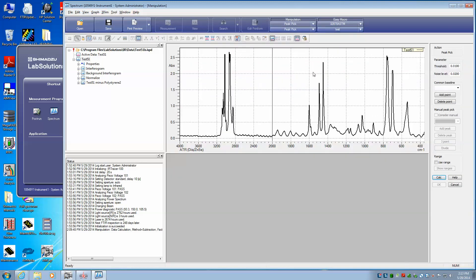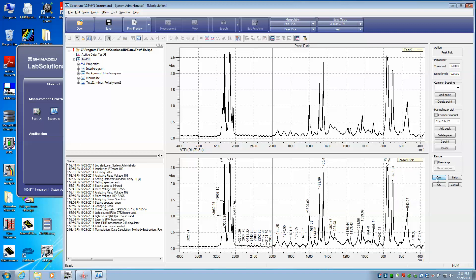This opens a new window and allows us to set our parameters for peak picking. Let's go ahead and say calc, and that way we'll see where we are.